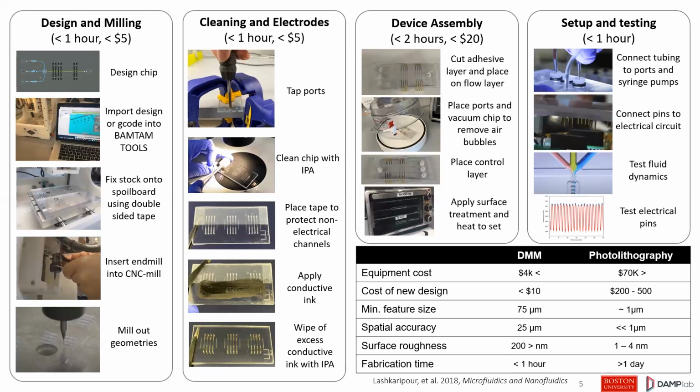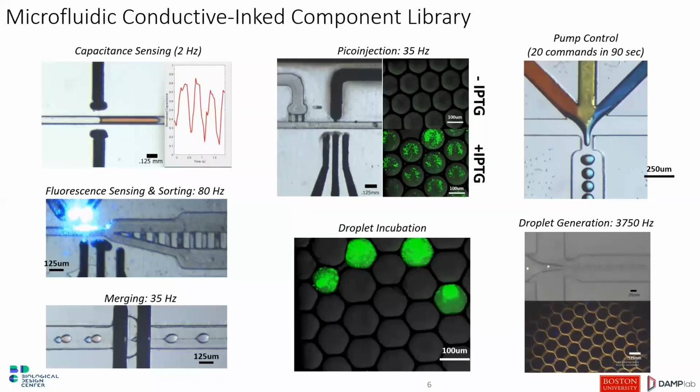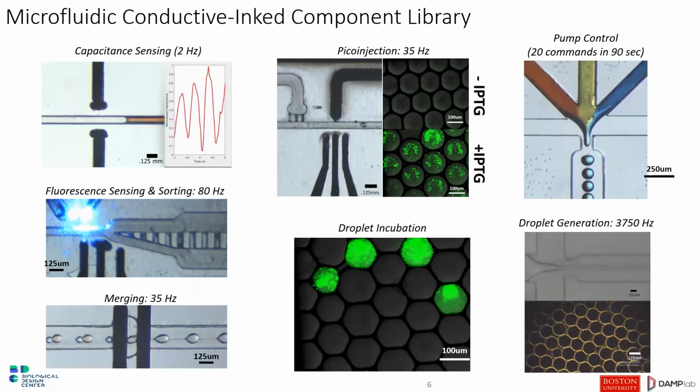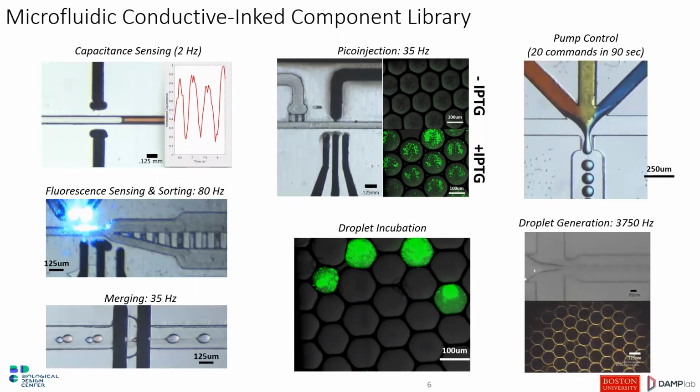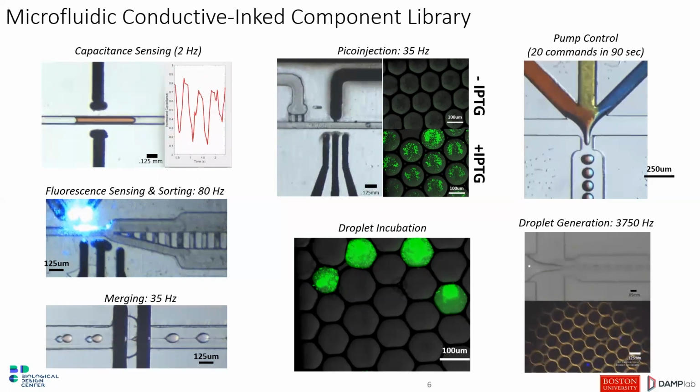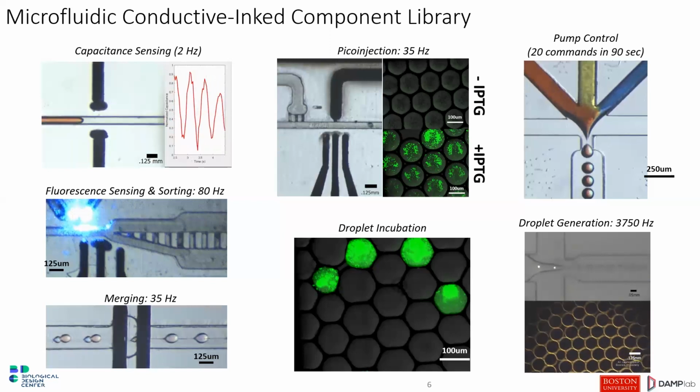But depending on what you need, you don't need so much precision. You just need something as proof of concept and move on, right? And that's our take in this environment. And just to give you a little idea of what type of microfluidics they look like, some of them look like that. Those are a bunch of components and devices that have been published throughout maybe the last 4 to 5 years.